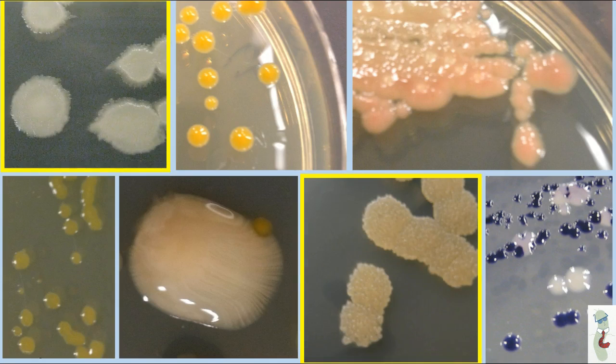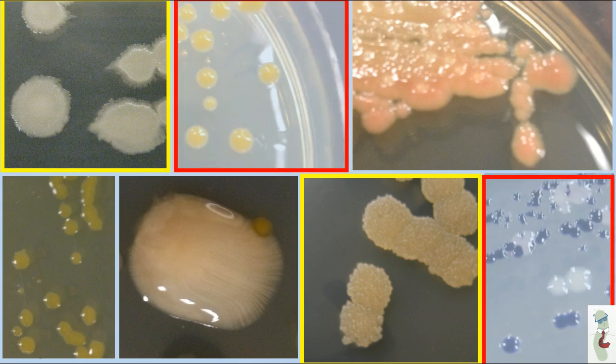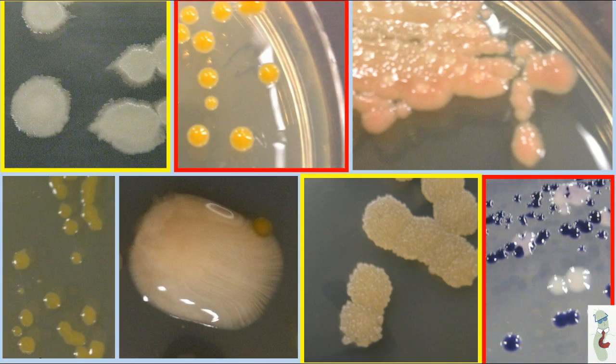The white colonies in the upper left-hand corner and the bottom yellow colonies are examples of dry, flat colonies with jagged edges. Whereas the top center yellow and the bottom right white and purple colonies are raised or convex in shape, with smoother edges. Both are shiny because they have a higher water content. And colony size is also a unique feature. You'll notice that some bacteria make larger colonies than others.